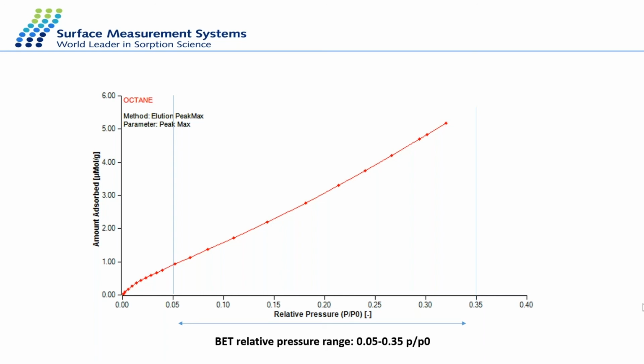Maybe to measure dispersive surface energy, there are some not very well established, but some new methods which are based on aromatic hydrocarbons instead of normal alkanes. So I recommend having a look at the literature, but I can also help to find some solution for measuring the dispersive surface energy of this kind of samples.